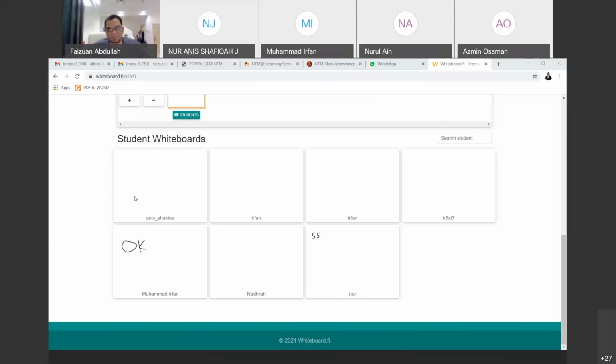In this idea, the relative response between the unknown and the standard is always constant.